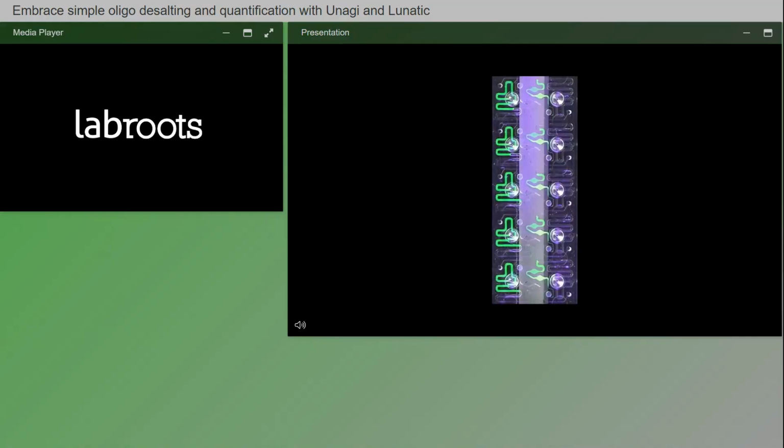Inside of Lunatic, samples are pumped into those microcuvettes. So on the left, we have samples that are just loaded and have not been read. And on the right, we have samples that have been pumped into the microcuvettes. They've been read in Lunatic. And you can actually see this is a high Lunatic plate. We're using 2 different path lengths of wells, and that gives us a very large dynamic range. And that's kind of shown by the different brightnesses between those 2 cuvette volumes. That corresponds to the 2 different path lengths, which gives us a huge range of concentrations.